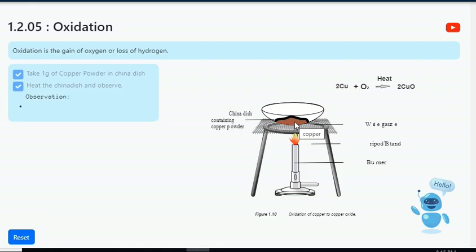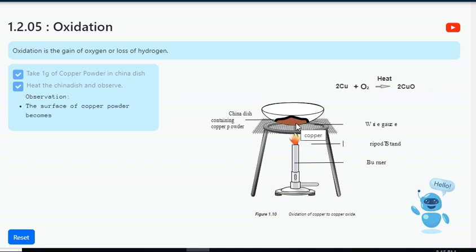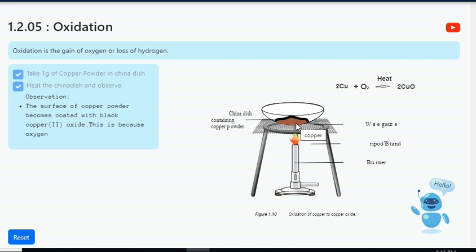Observe the reaction: the surface of the copper powder becomes coated with black copper(II) oxide. This is because oxygen is added to copper, and copper oxide is formed.